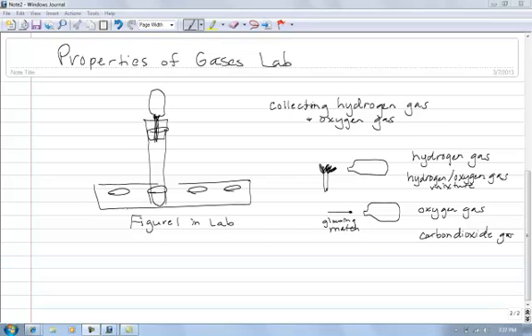This is similar to what's in Figure 1 in your lab except it's a lot better drawing. This is my well plate, this is the test tube. In your lab kit there should be a black rubber stopper with a clear plastic thing going through the center. That's the gas collection stopper. And then this is the pipette with the open mouth at the bottom.